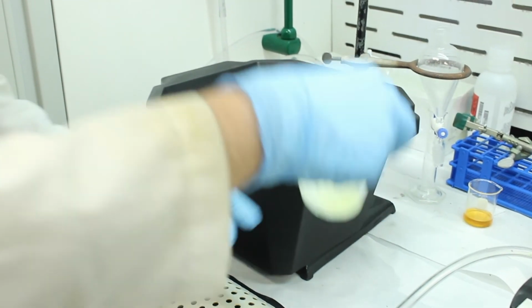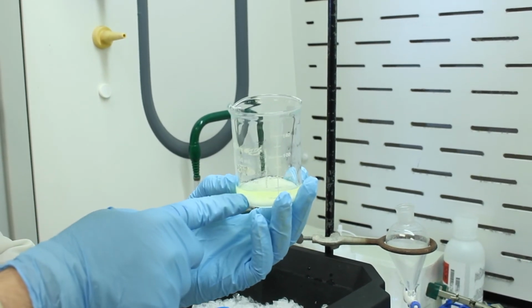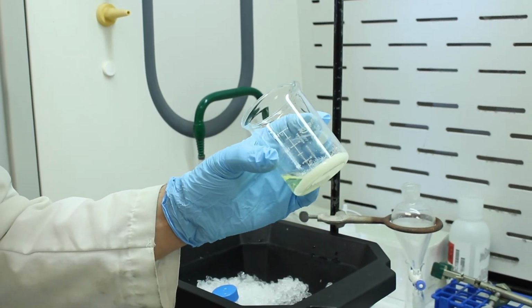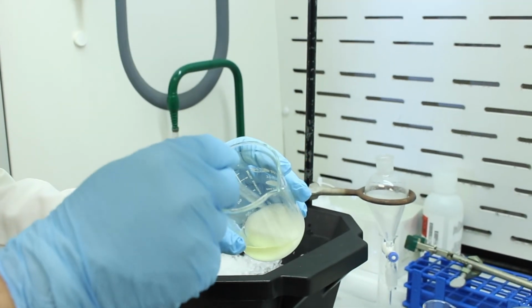Okay, so here we have our mixture. We've removed it from the hot plate. It stopped the boiling. So the residual solvent in here is hexane, and you can see it's yellow, but our product is nice and white. So what we're going to do now is, I guess the first thing I'll do is try to break up this solid just to make sure it's suspended.